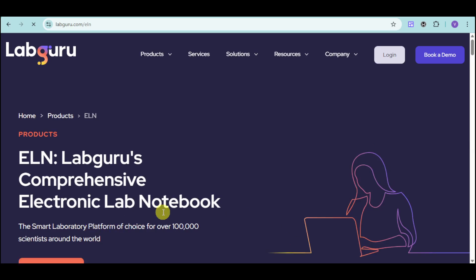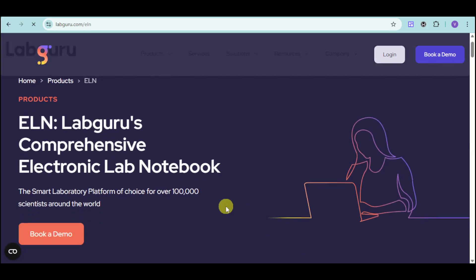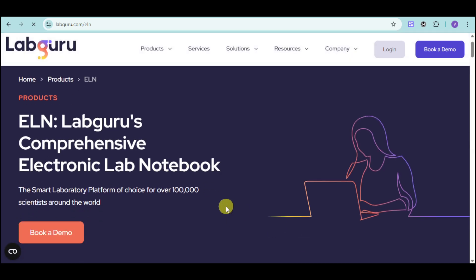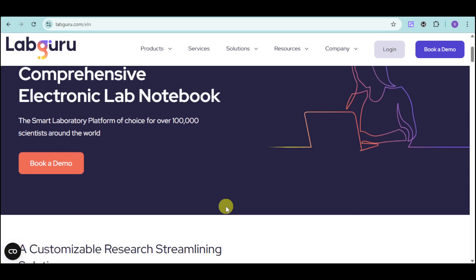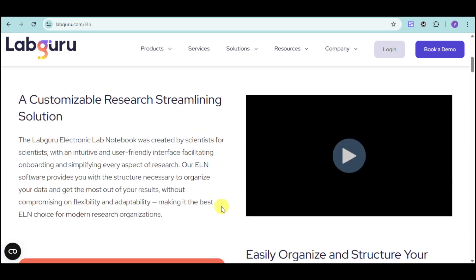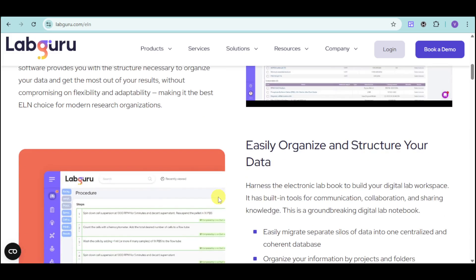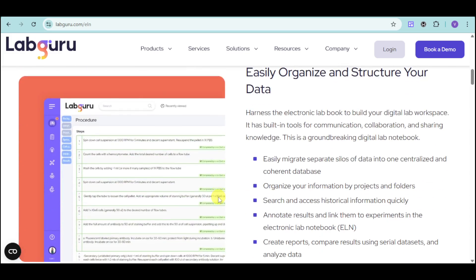They have a comprehensive ELN that is the choice for over 100,000 scientists. This is a customizable research streamlining solution that is good for you. You can easily organize and structure your data through this way.